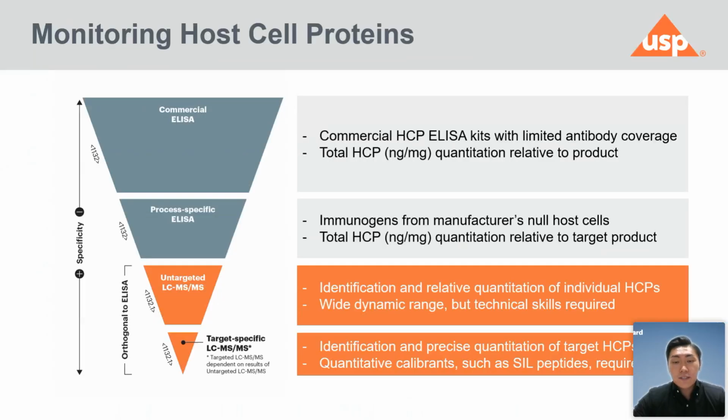And these require quantitative calibrants, such as heavy isotope-labeled peptides.